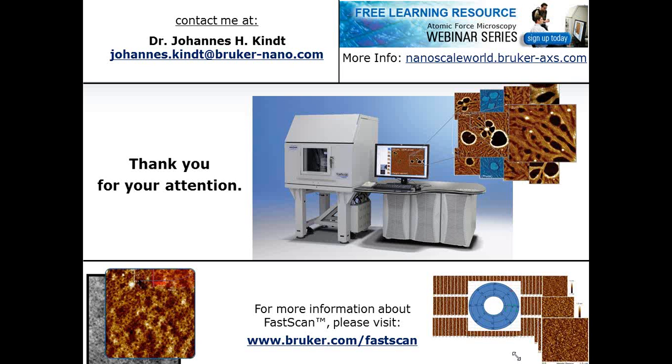Of course, comparing SEM with AFM, there is one big difference. The SEM is basically the perfect photo camera in the sense that it has almost infinite depth of focus, whereas with the AFM you are physically limited to the length of the cantilever tip as a maximum, because after that the cantilever itself will come in contact with the surface.